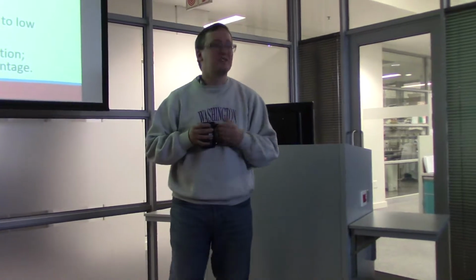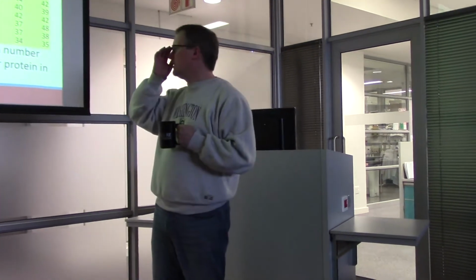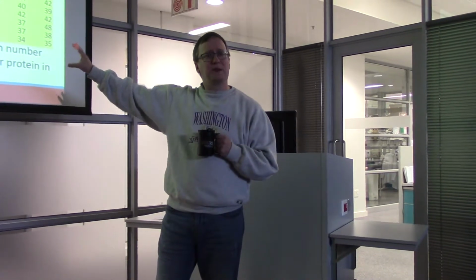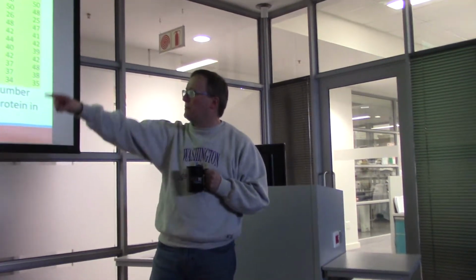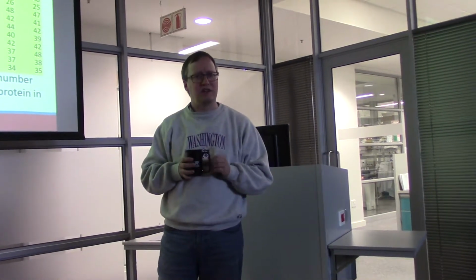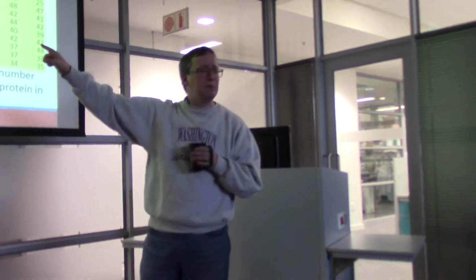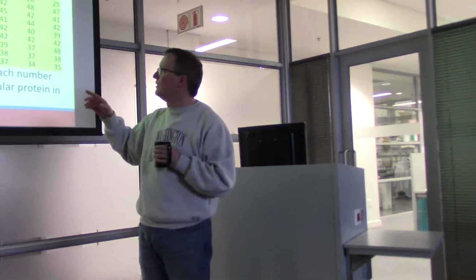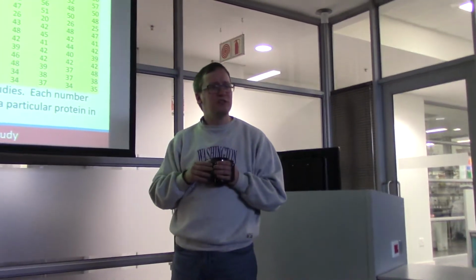Those from abundant proteins have an advantage. Now these are kind of old data at this point, but I think the point is still very commonplace. You will very frequently find in spectral counting studies tables that look just like this. Each row here starts with a P. These are all Swiss-Prot protein accessions for proteins in E. coli in this case. We have shot 5 samples that are red 1 through red 5, and 5 samples that are yellow 1 through yellow 5. And we're trying to determine which of these proteins, represented by rows, are changing between these two cohorts.